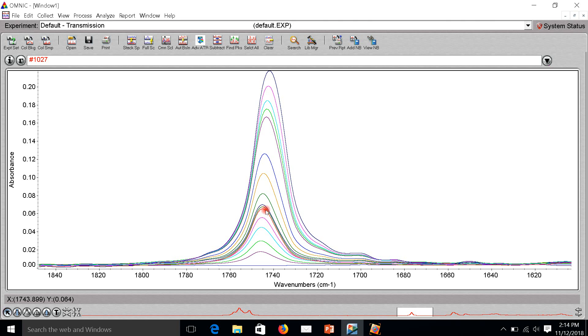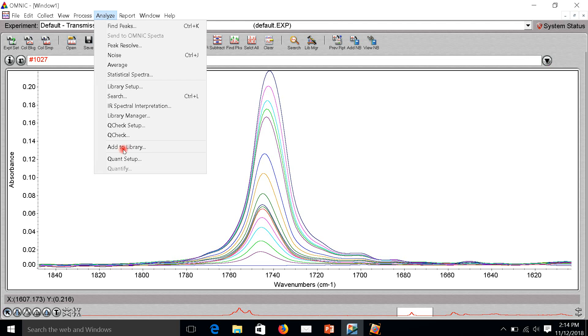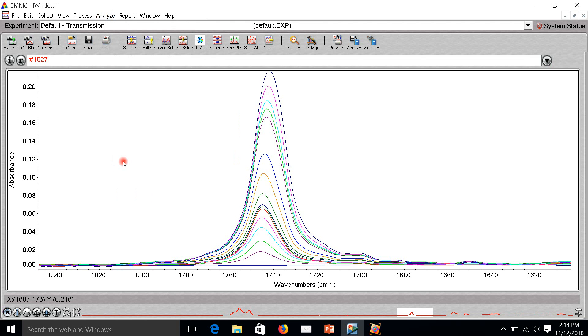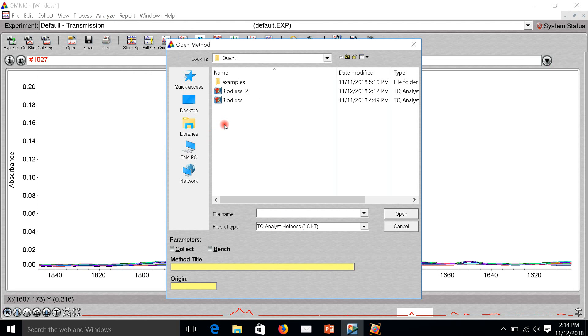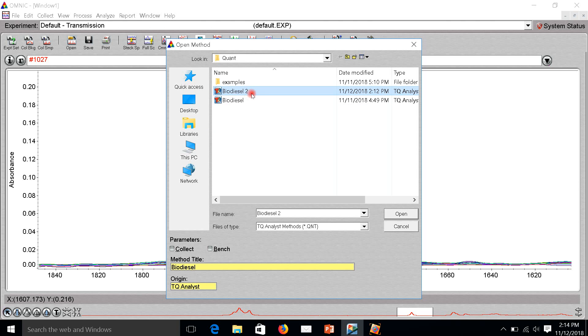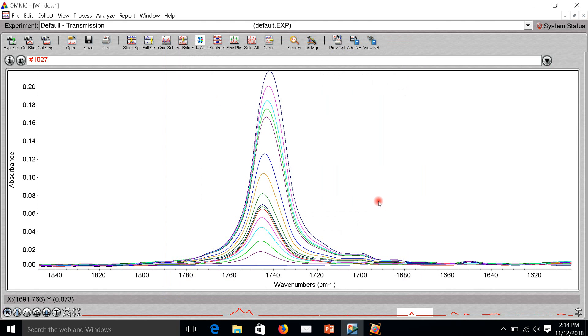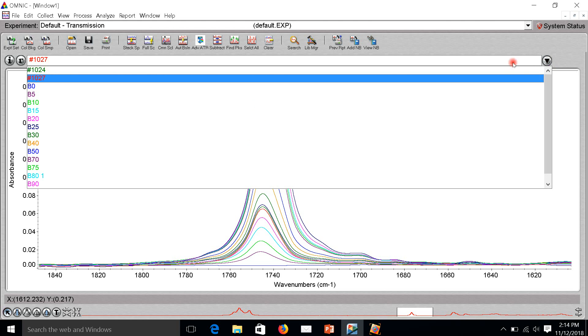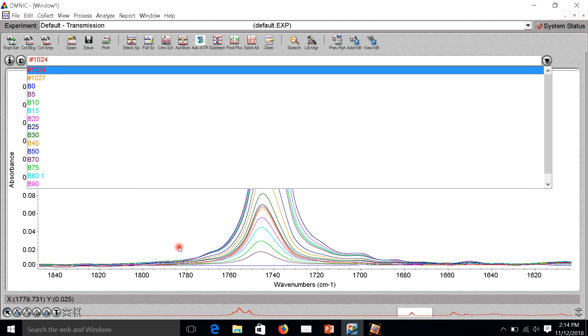My sample here, I guess the concentration is around 23 or 24. Let's check with our quant. First, we have to select one method we already made. This one is biodiesel 2. I have to open it and select the sample, turning to the red color, and just click analyze and quantify.